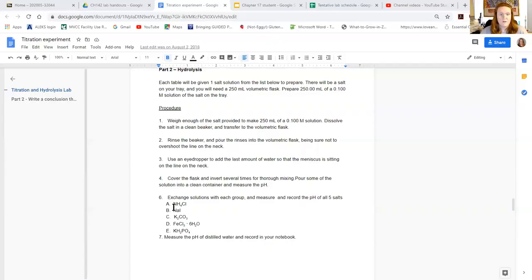Part two is normally done as a group. So in this case, what we're going to do is you each will have one of the five salts that you need to measure the pH for on your table. Okay. So these are the five salts. You have to make sure you measure all five of these before you leave lab on the day of the experiment.